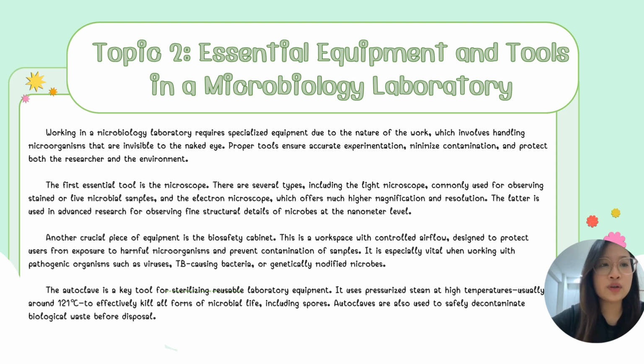There are several types, including the light microscope, commonly used for observing stained or live microbial samples, and the electron microscope, which offers much higher magnification and resolution. The latter is used in advanced research for observing fine structural details of microbes at the nanometer level.